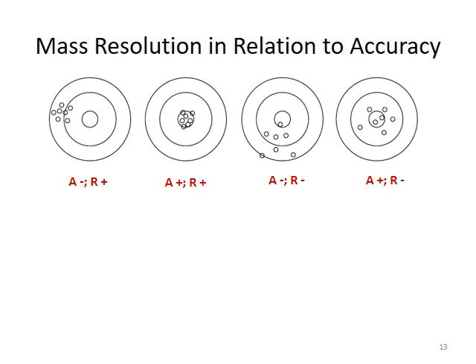But the average of these measurements may or may not deviate greatly from the true value. This will suggest mass accuracy. If it is close to your true value, it means high mass accuracy is achieved. If it deviates from the true value, it means poor mass accuracy.